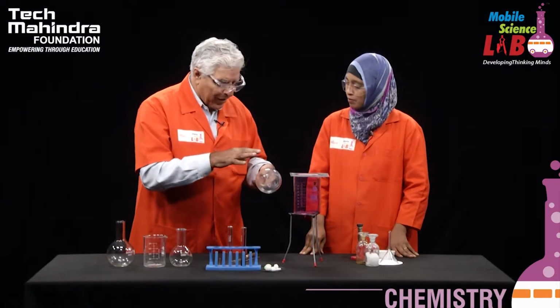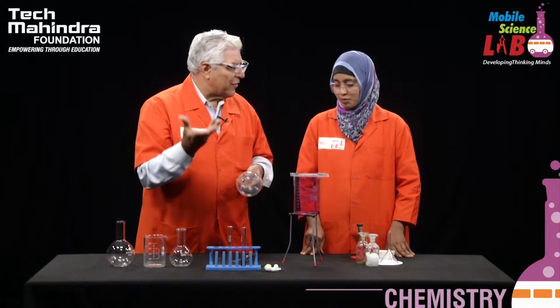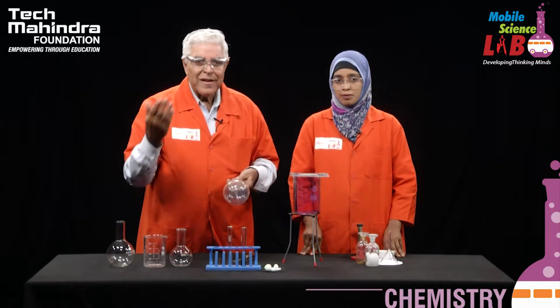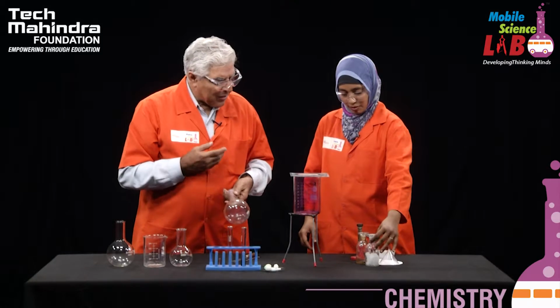Khatija, you can do one more thing. You can scrape these crystals off. Again you can make use of them, and again it will turn into vapor. So this is how sublimation takes place. Another very common example, Khatija, would you like to do that experiment, which you will take some camphor and do it? Okay, sir.